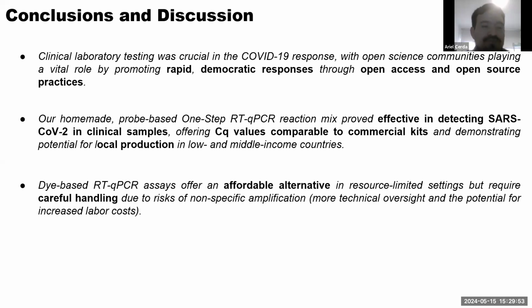Dye-based RT-qPCR assays offer an affordable alternative in resource-limited settings, but require careful handling due to the risk of non-specific amplification. We think that strategies like establishing a precise cutoff cycle or using contamination control measures can mitigate some of this challenge, making these assays a viable yet demanding option for cost-sensitive environments.